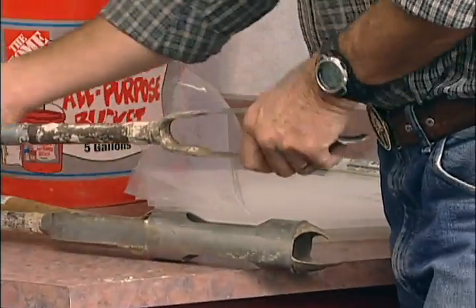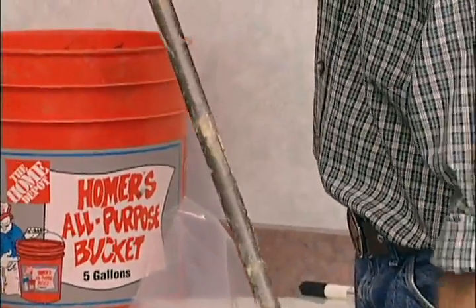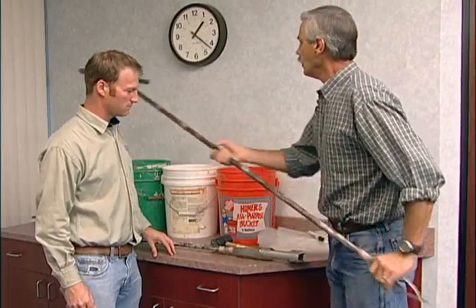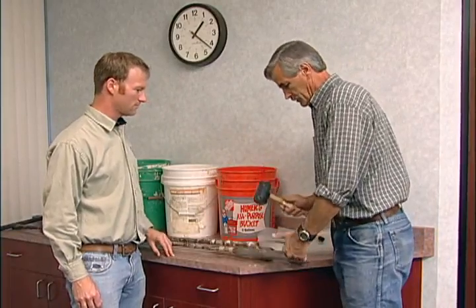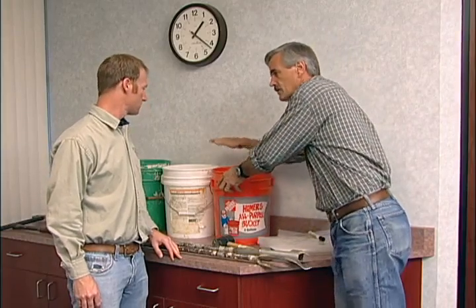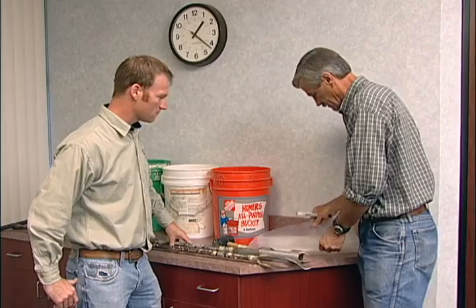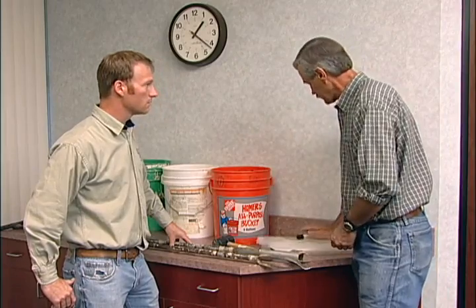This is a Dutch auger — what we're going to use to cut the ground. It's on an extension that will get us down to the depth we need, giving you enough room to stand up and twist without breaking your back. You need a mallet to knock the soil out of the auger into a bucket. We'll take a bucket for each depth we want to sample. You need plastic bags or a sample bag from the lab, and a marker to label the bags so you know where the samples came from.